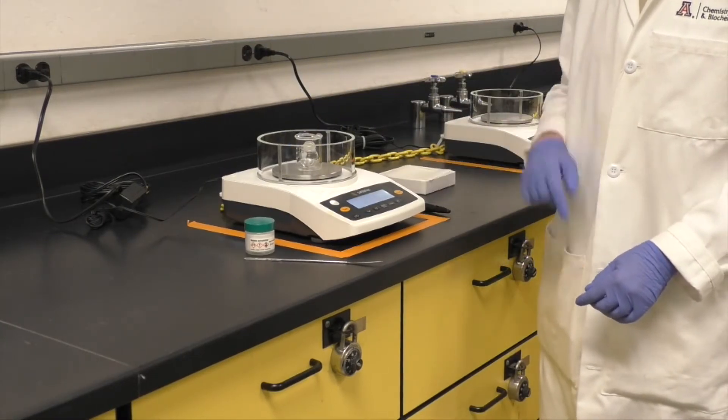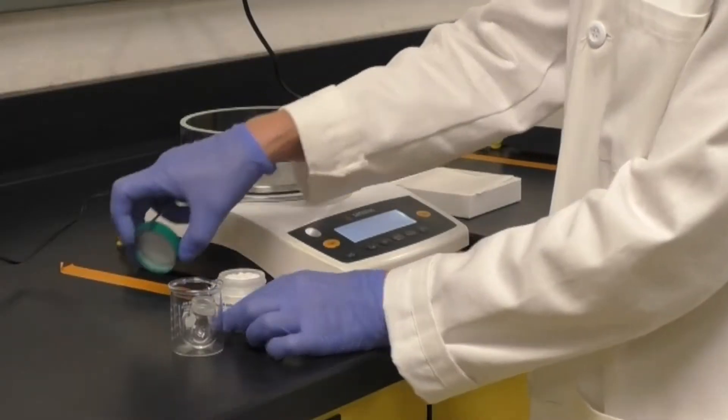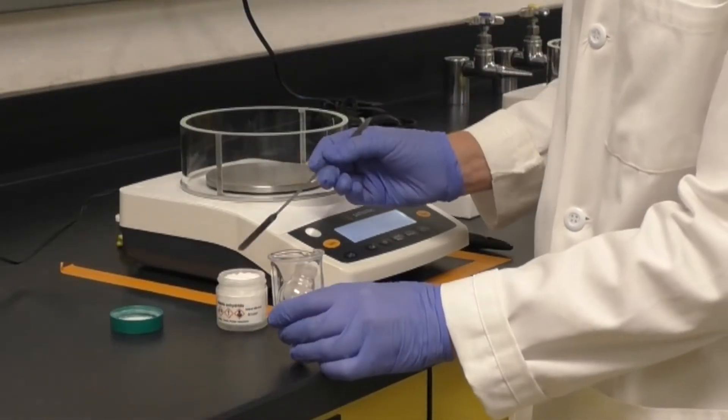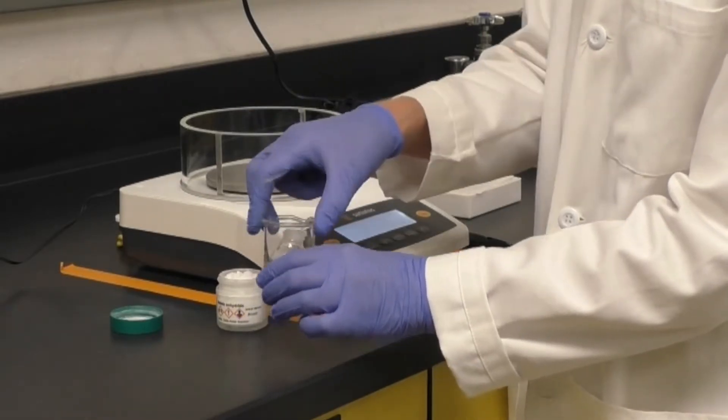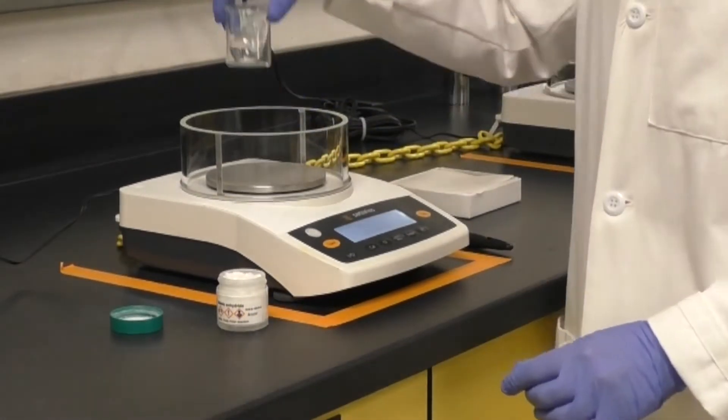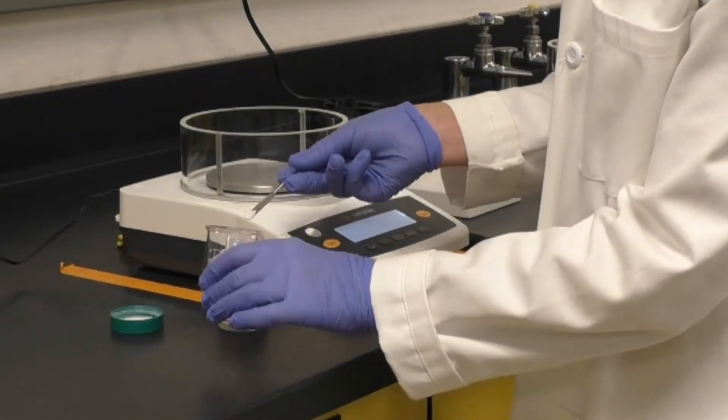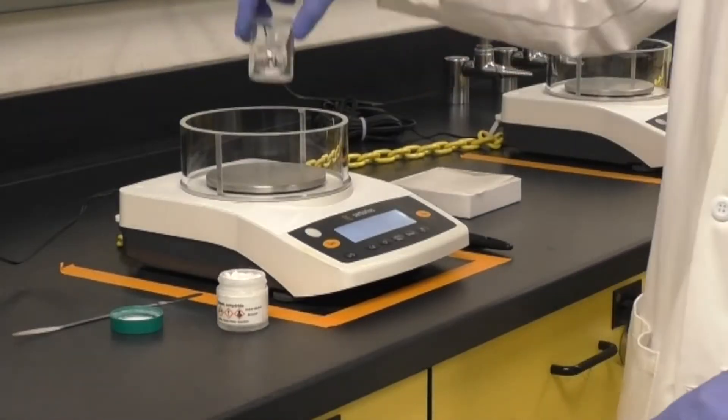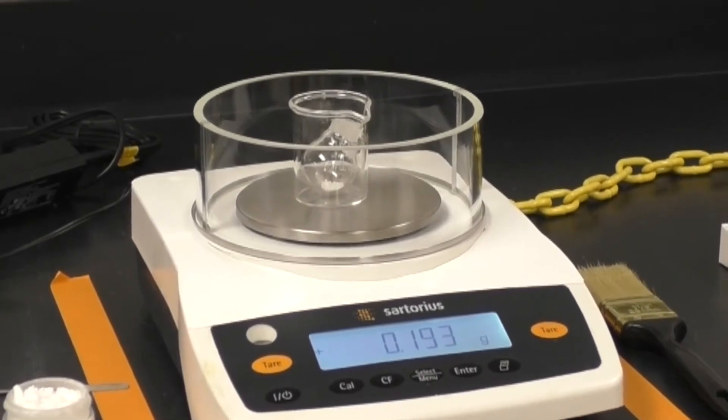Weigh out 180 to 200 milligrams of maleic anhydride into the 10 milliliter round bottom flask. Once you have your exact weight, calculate the volume in milliliters for one equivalent of 2,3-dimethyl-1,3-butadiene. Record your masses in the data table in your lab manual.